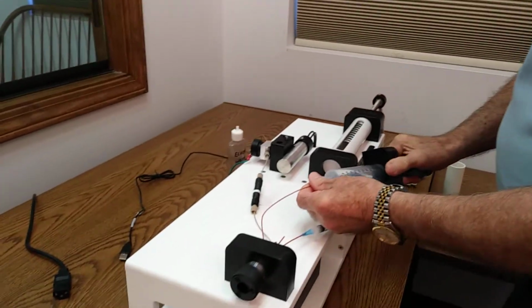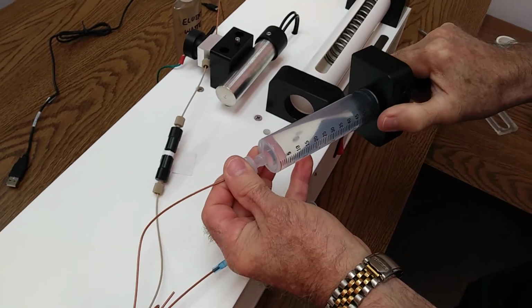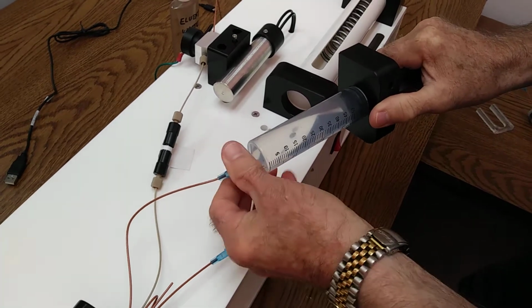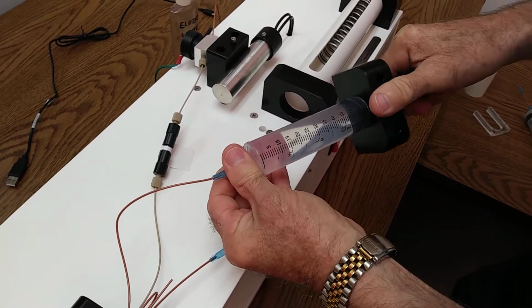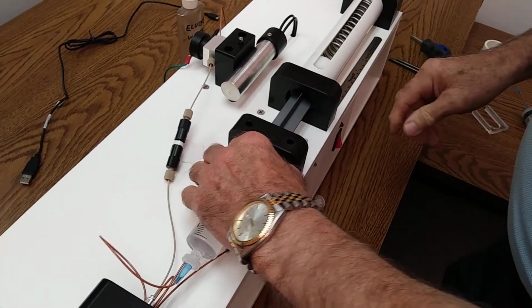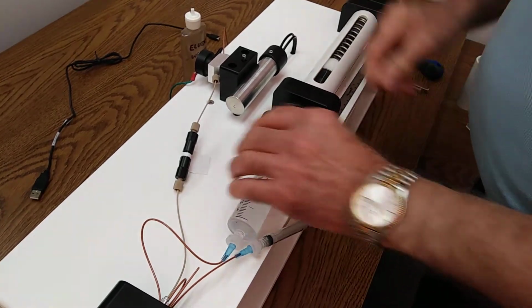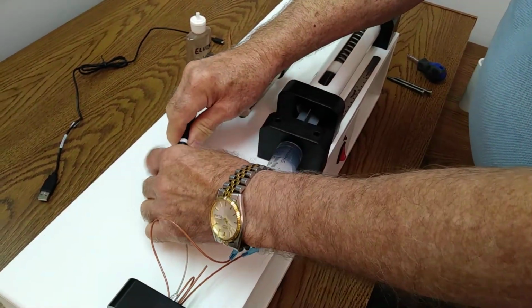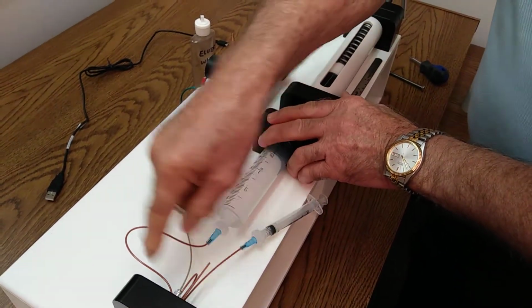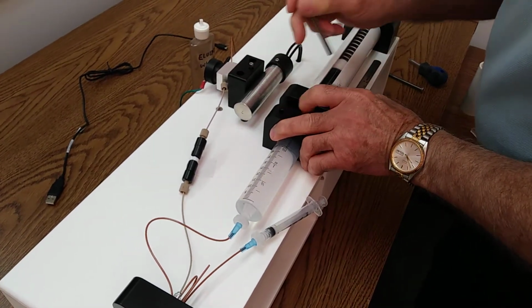Now I'm going to come over to here and gently put a little pressure on the plunger with my right hand and let the flow displace the little bit of air that's captured in there. We want to avoid getting air into the system as much as we can. So now I'm going to crack the fitting over here and let it leak. The reason for that is to displace any air that may be trapped in the lines. I want it to go out here on the top instead of into the detector.